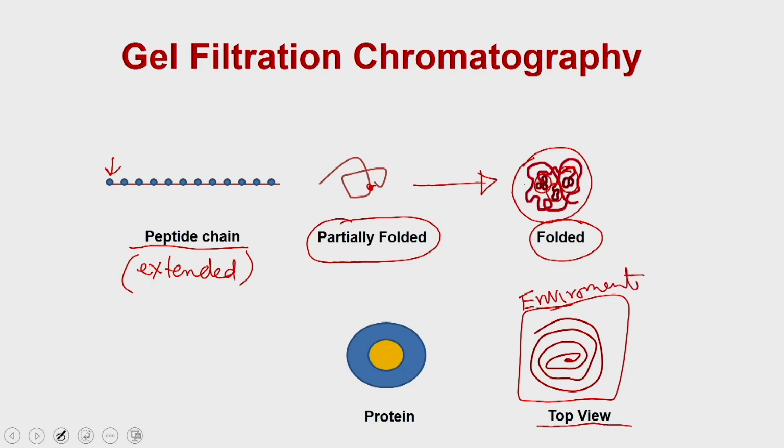In most cases, factors like the pH, the salt and others present in the microenvironment affect the packaging of these protein molecules, but at the end it is going to arrange around the center. And that is why, if you would like to characterize a protein, you can characterize it simply by knowing the radius of gyration or the diameter of that particular ball.